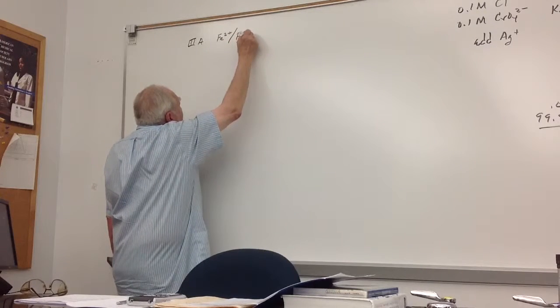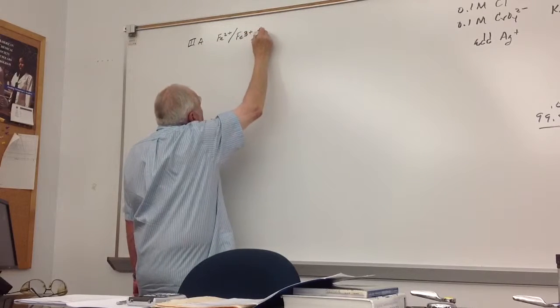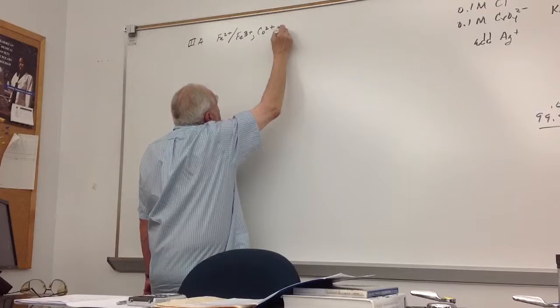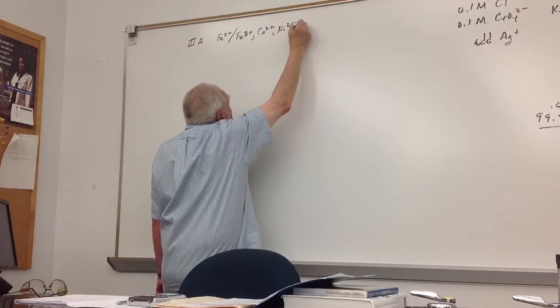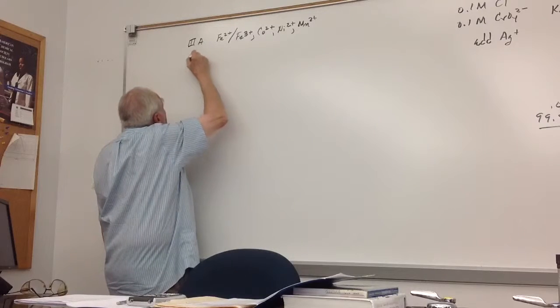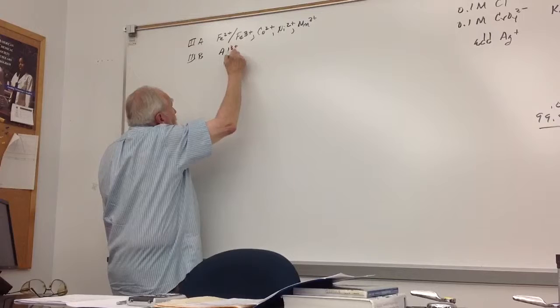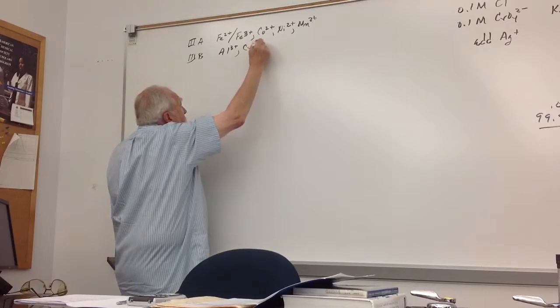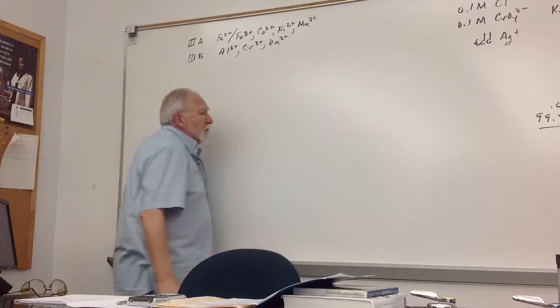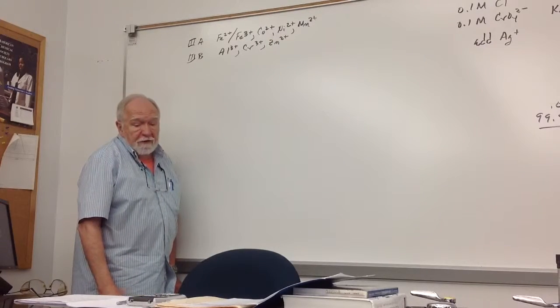States, as I said, so I'll accept that. That's a 3. 3 is common. The aluminum group. Those are the ions. Now I said when you mix up the known, you don't have to, just to speed things up.